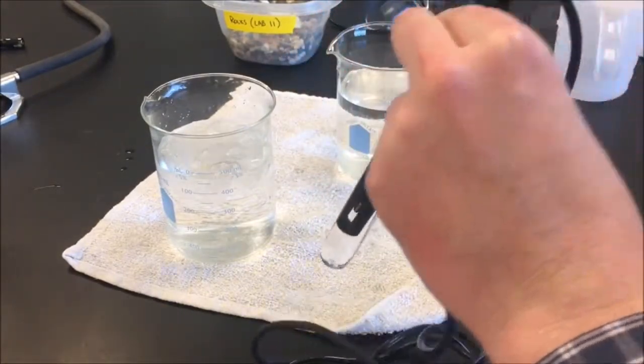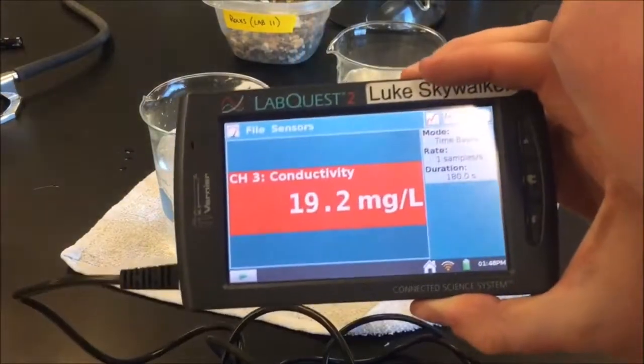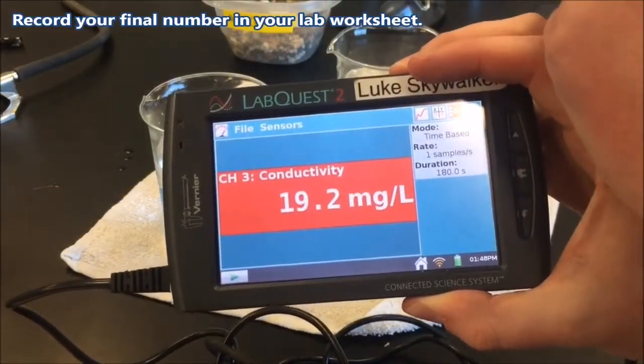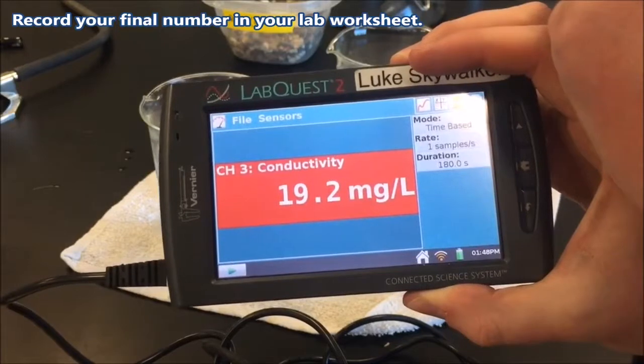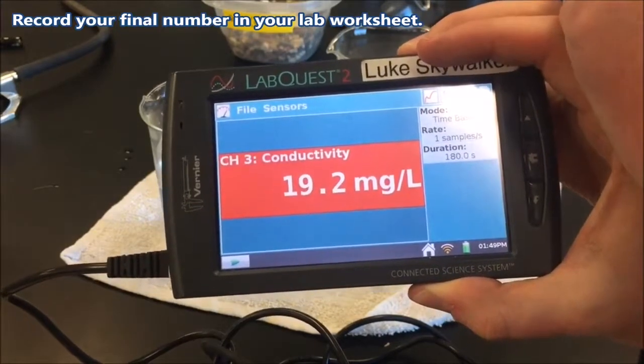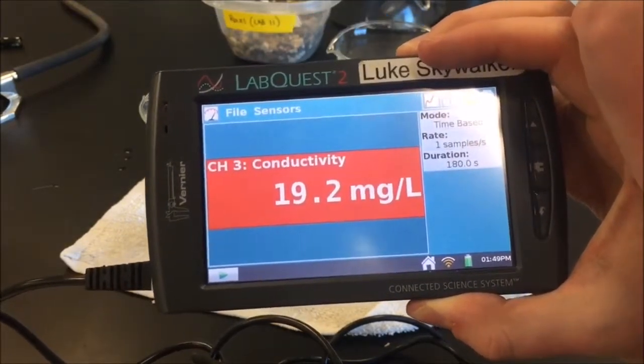And then we'll measure the conductivity of our new solution, which as you can see, is significantly lower than what we started with, about 19.2 milligrams per liter.